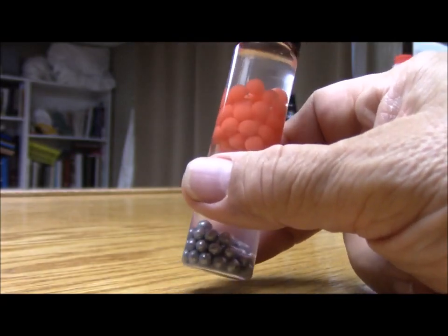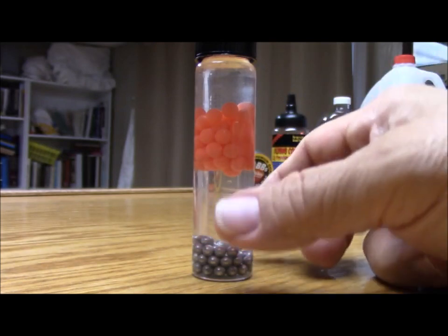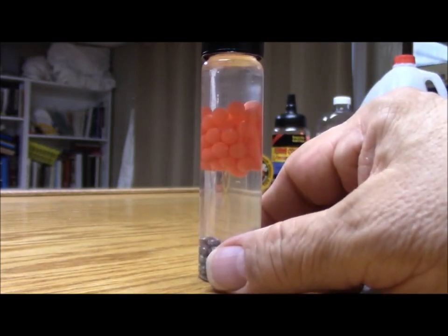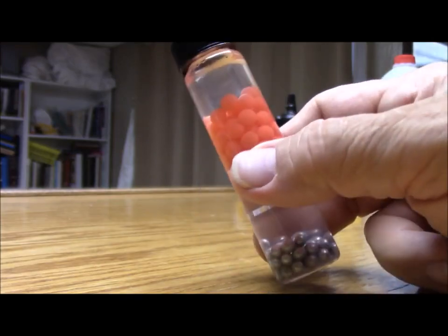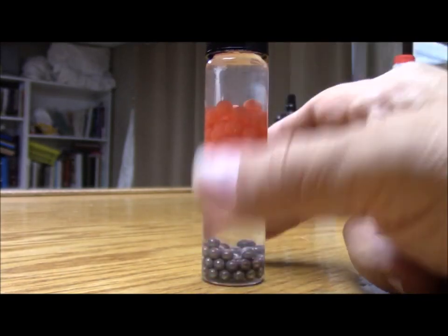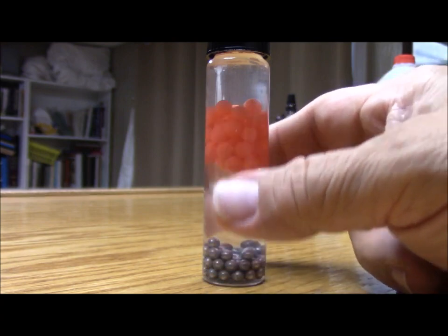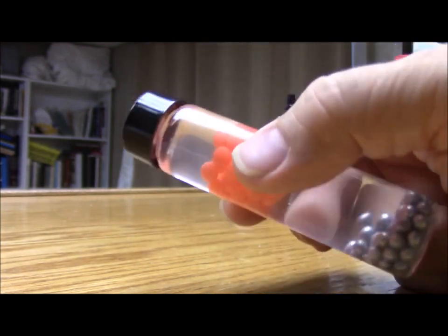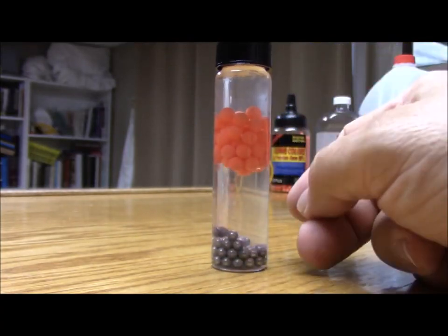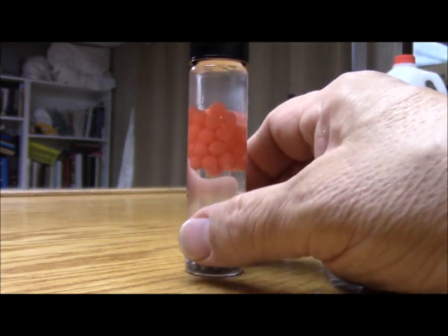Now, the next question is the sample contained in this vial a pure substance or a mixture? So on the paper, circle your choice. I know what I think it looks like, but I'm not going to give you the answer. If you think the sample contained in this vial is a pure substance, then tell me, is it an element or a compound? Or if you think the substance in this vial is a mixture, is it a homogeneous mixture or is it a heterogeneous mixture? So go ahead and circle your answer there on your paper. Which one of those do you think it is?